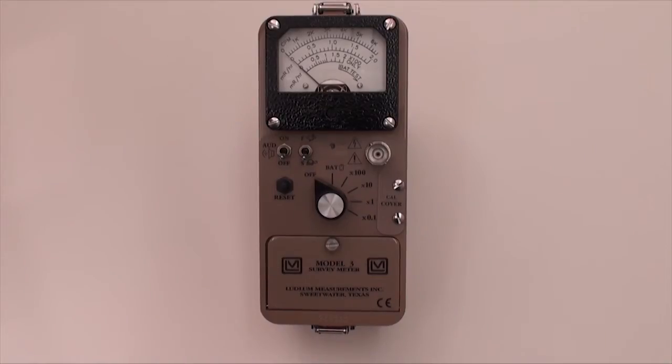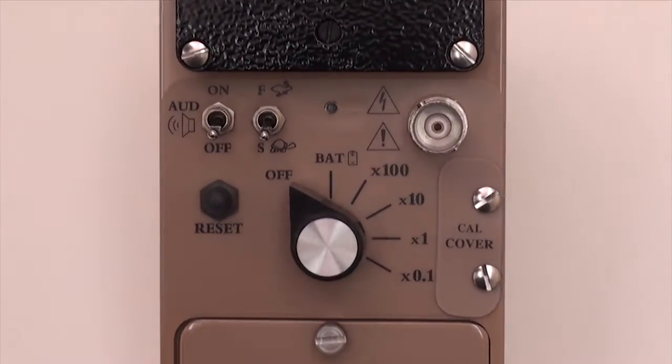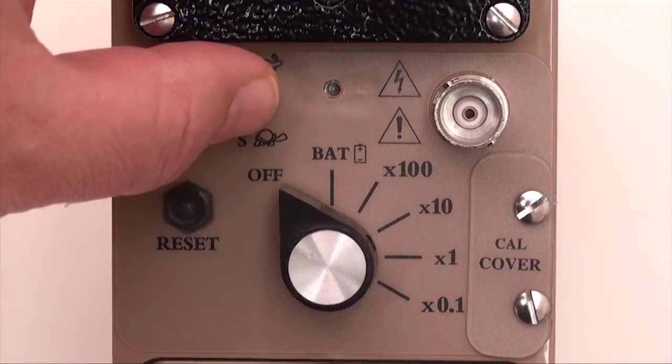The controls on the front panel are designed to be simple and straightforward. They utilize rugged, high cycle type switches that provide positive tactile feedback and deliver long lasting service.